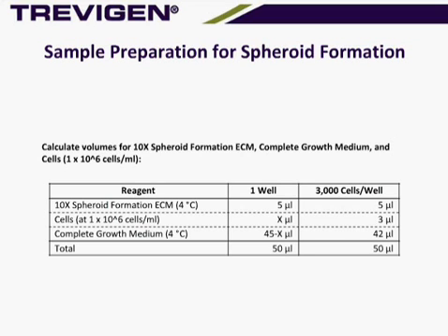What I've set up here is for one well, and this can be scaled up for multiple wells. And for one well, we're looking at a 50 microliter volume.